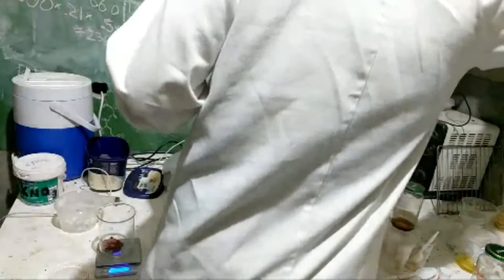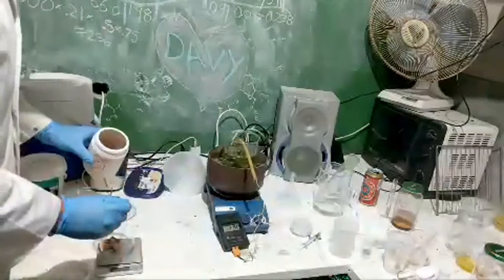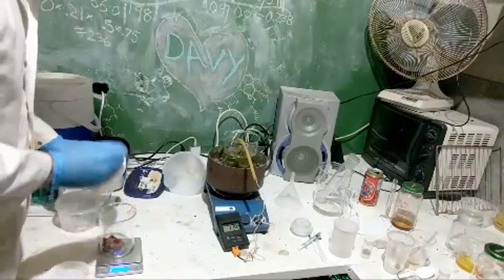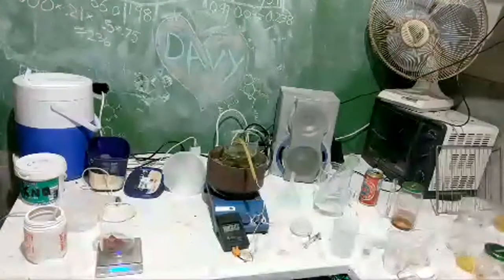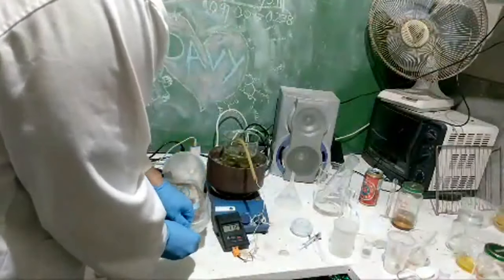Hello. Yeah, there's no iron chloride, so I could convert it, I suppose. I don't think we need to, do we? We're gonna try it my way, and it's not gonna work, but that's science, isn't it? 7 grams. Was it 7? Let's go 7. 8 grams. I pulled that number from thin air. Alright. Now, hydroxide. Where is it? Here. I should measure the amount, but I'm not going to.